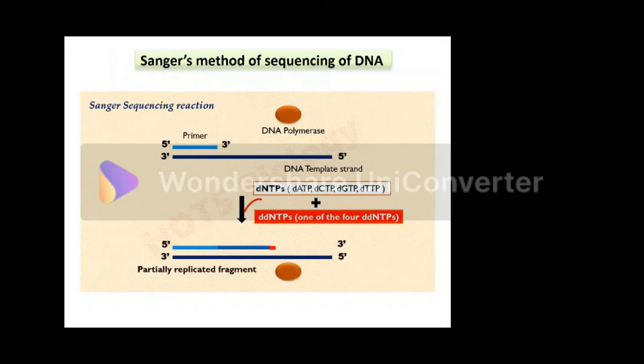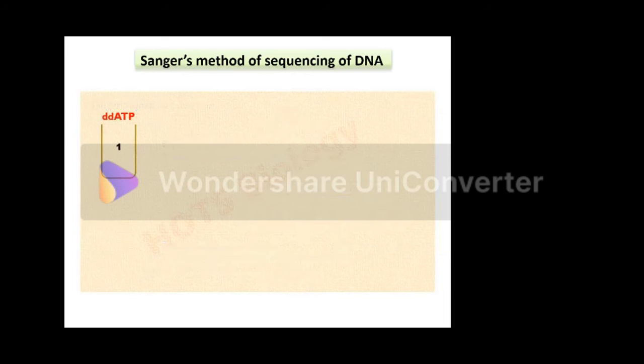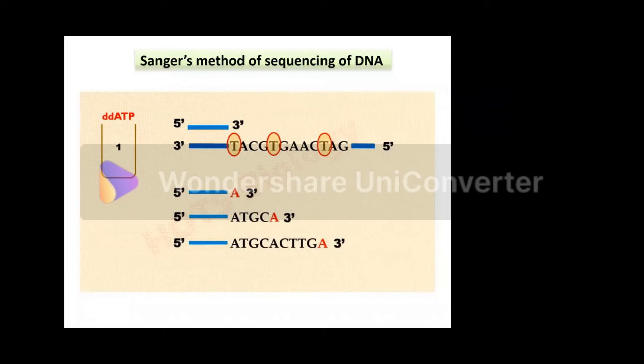Let's understand this for the first reaction. This is our DNA template strand and this is the primer. ddATP is present in lower amount. ddATP will be incorporated occasionally wherever normal dATP is to be incorporated, complementary to thymine residue. And each time a ddATP is incorporated, the DNA synthesis terminates. So, as you can see, there are 3 thymine residues in the template strand. Complementary to these thymine residues, ddATP can be incorporated in the new strand. At the end of this reaction, there will be 3 partially replicated DNA fragments.